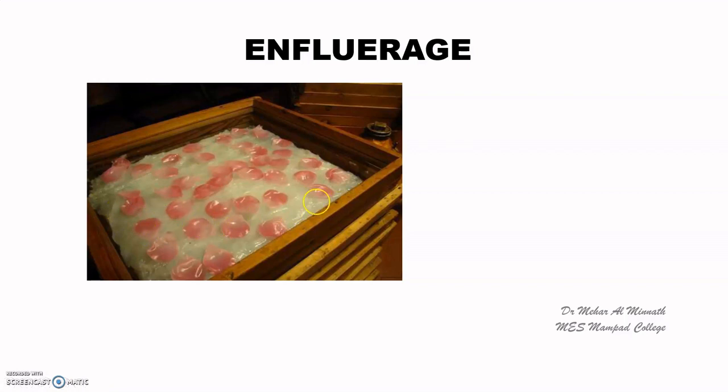Okay, you spread the fat and heat it to up to 50 degrees centigrade. And on this hot fat, you place the plant material, particularly the flower petals. So rose petals, jasmine flowers, etc. are placed on this, and then keep it as such for 24 hours.